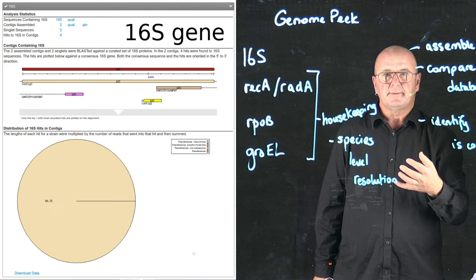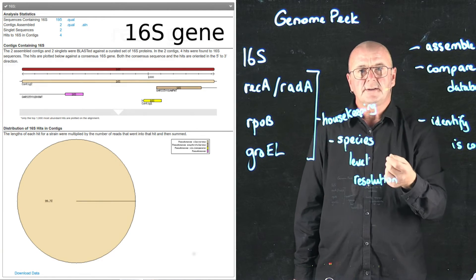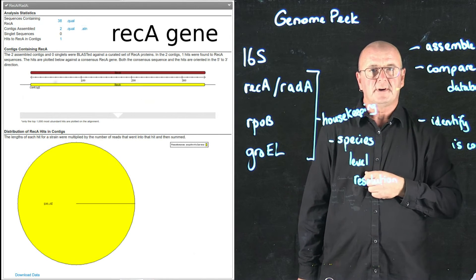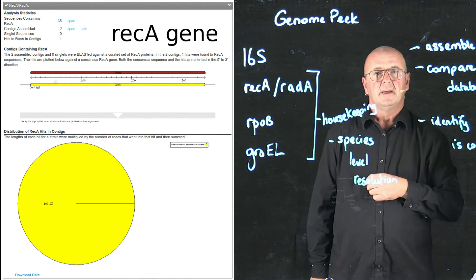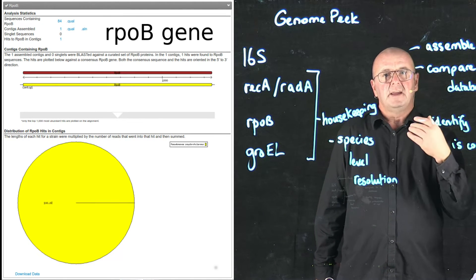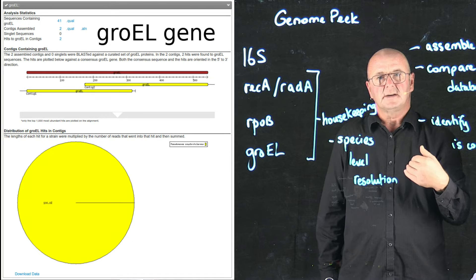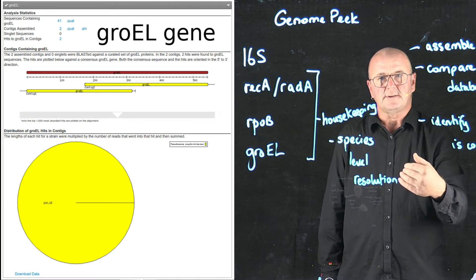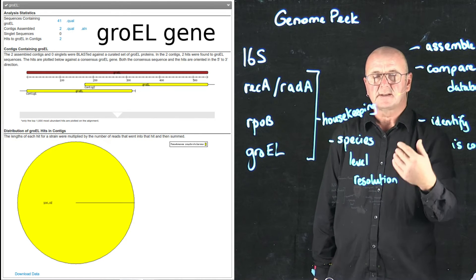And so in the first example here, we've taken a single genome where we've been able to get a pure isolate for that genome, and we've uploaded it to GenomePeek. And you can see that each of the four markers are showing there's only a single organism that's present in that dataset.